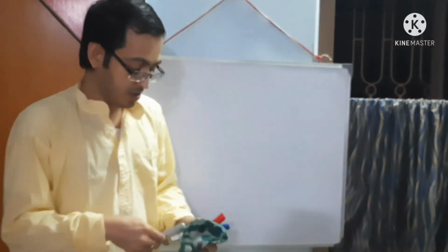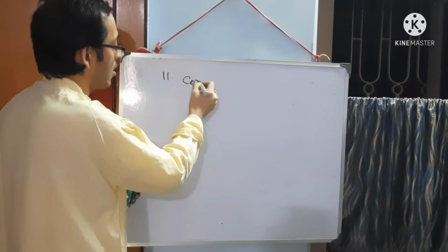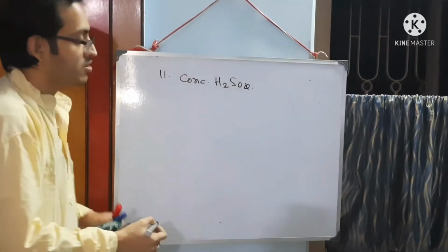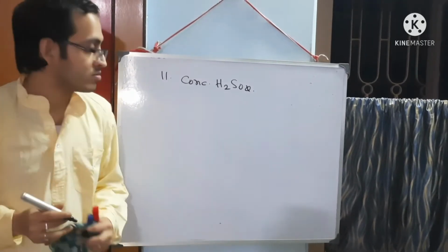One thing I just forgot, that number 11, that is concentrated sulfuric acid. I just forgot to mention that.